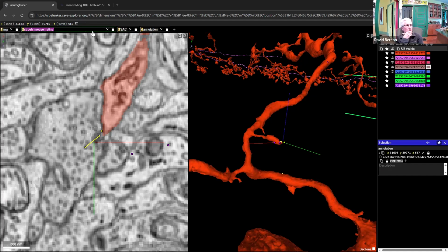I was just going to ask, so the idea is that for Eyewire 2, there's lots of things that I would be doing with the volume that will instantly be available to anybody else who's working with the same volume, but that's not true of these annotations. Yes, that's correct. Essentially, I should only be using the annotations for things that I'm going to be working with locally. And if somebody else in the project wants access to these, because I've identified a bunch of points that might be interesting to them, how would I transfer that? It would be, again, the sharing link, and I would then send them that URL and they can see it. Yeah, got it.